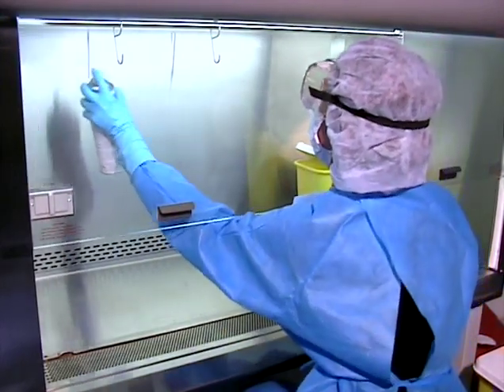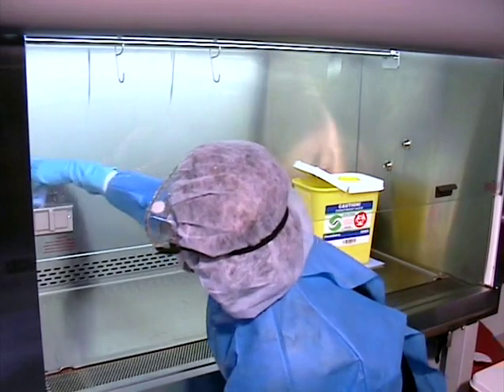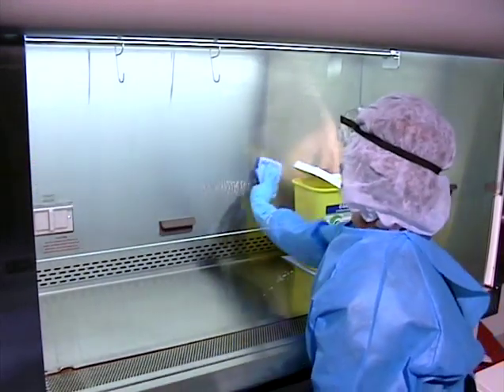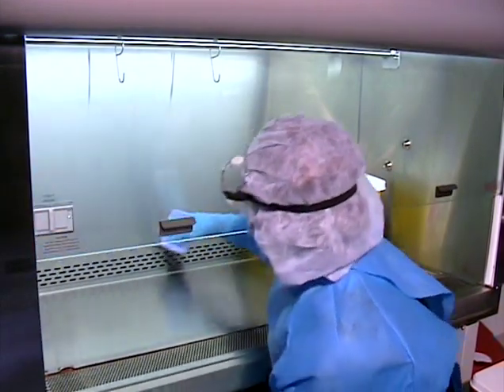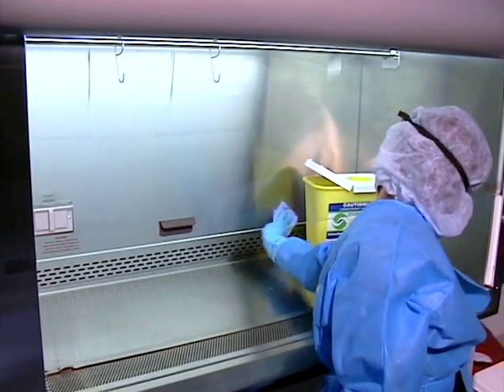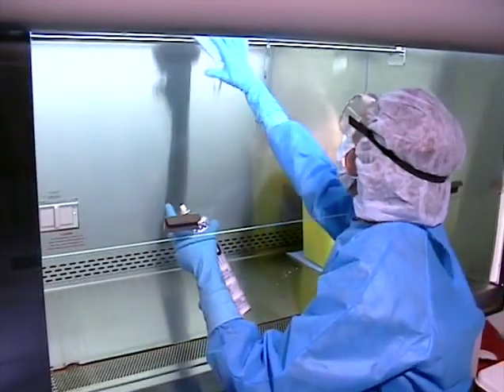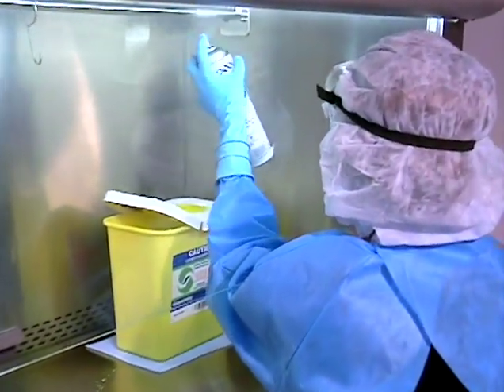Because the HEPA filter is located at the top of the work area, cleaning the interior surfaces should begin at the top of the back wall, again taking care to avoid touching the HEPA filter. Using strokes parallel to the HEPA filter, work your way from the top to the bottom of the back wall. Next, clean the IV pole and hooks, and then the side walls of the cabinet in the same manner as the LFCB.